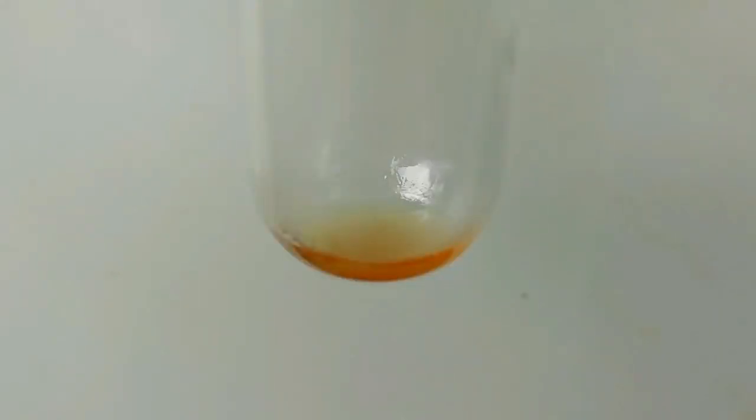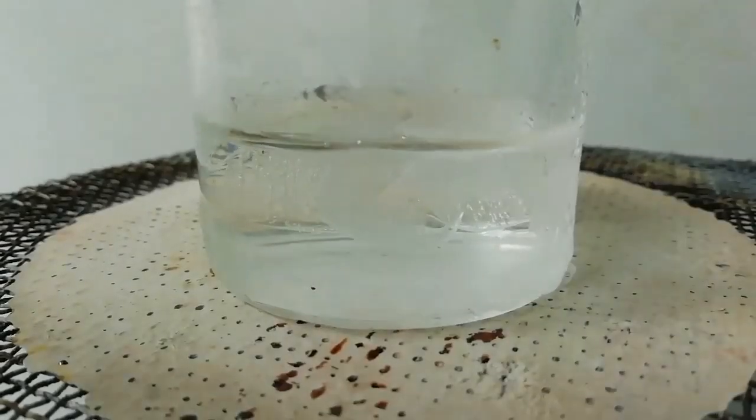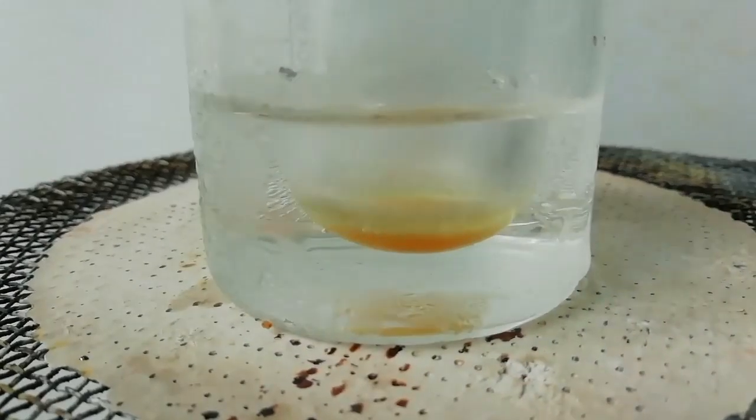After heating, the mixture looks like this. Now cool the mixture — here I use an ice bath, but it is not necessary.